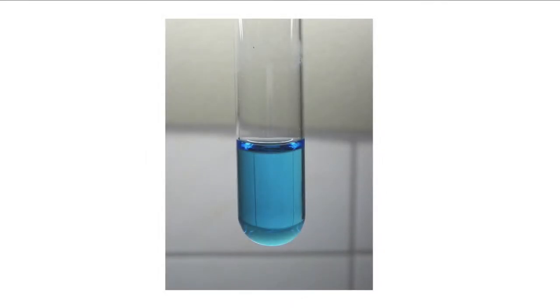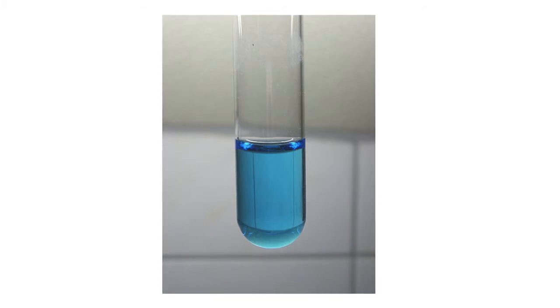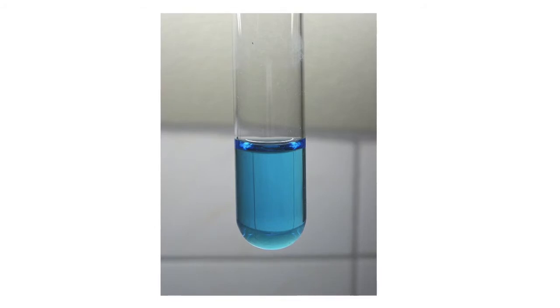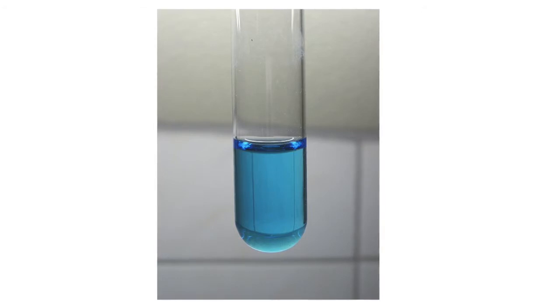So I'd like you to have a look at this image of a clear blue solution. Now this solution isn't blue because it's emitting blue light. It's actually blue because it's absorbing the photons of energy opposite to blue. So what I mean by this is there'll be a white light shining on the solution. And a white light means that it carries the entire range of energy across the visible light spectrum, from 400 to 750 nanometers. The energy of this light will be able to excite electrons to higher energy levels if the energy gap between the levels is equal to the energy of the photon.